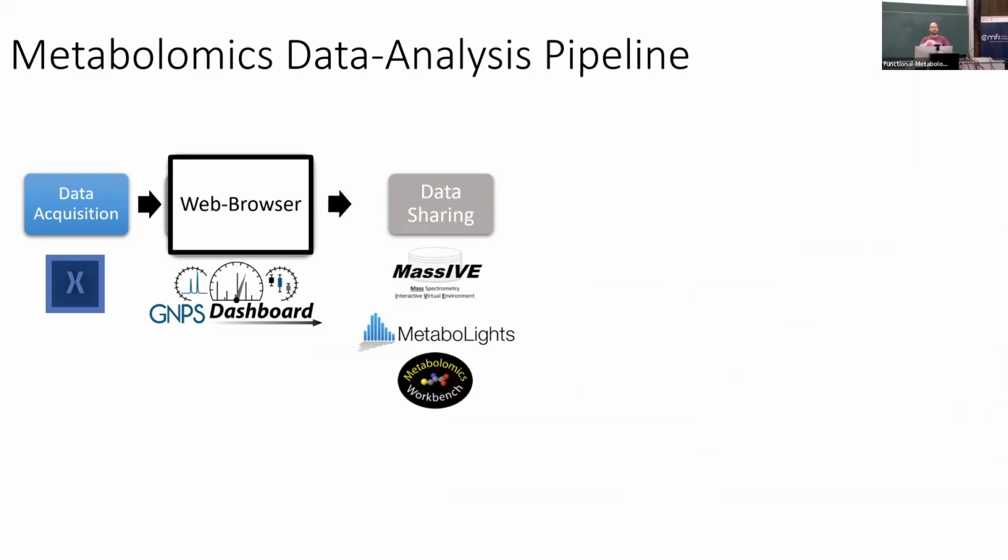dashboard is to have a very simplified version of this entire analysis suite and bring it into one place, into the web browser, so you can do everything in the cloud and you don't have to download or manipulate anything. Of course, this is not as sophisticated as what we showed you over the week. That's why we showed you all of that. But if you get started, or if you want to do a very quick analysis, you might find the dashboard suitable. And especially when working with others that are very new to that, you might not want to overwhelm them, but give them an easy start.